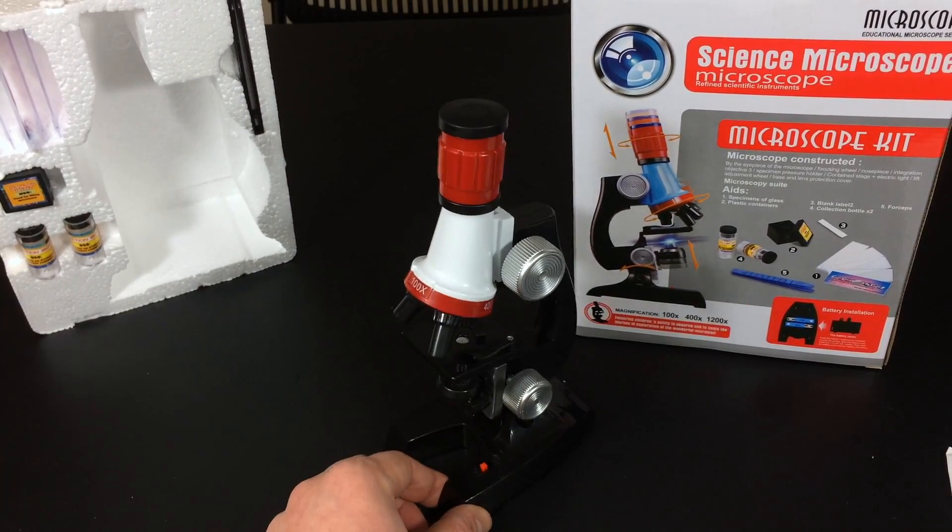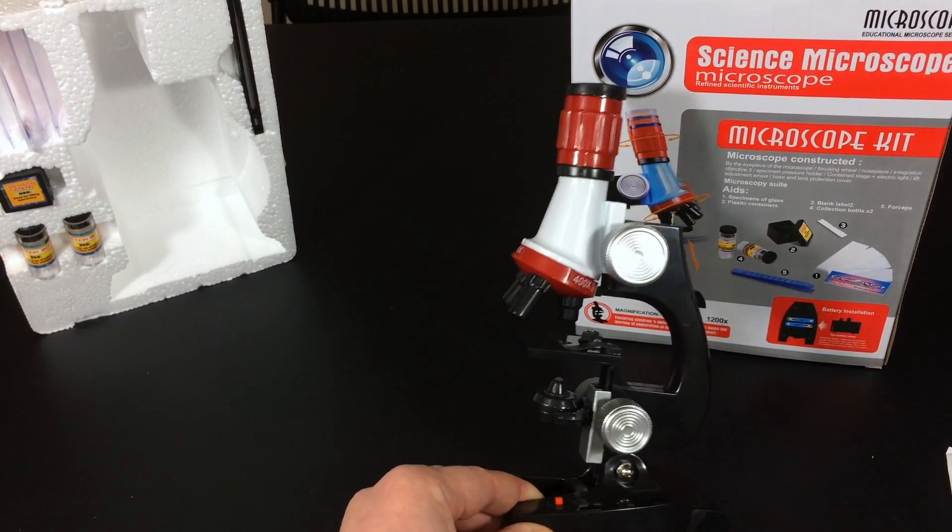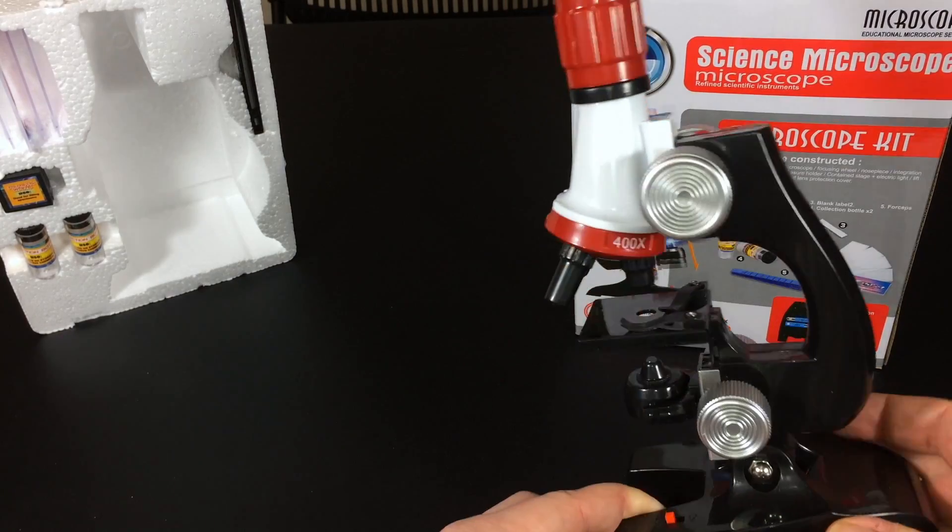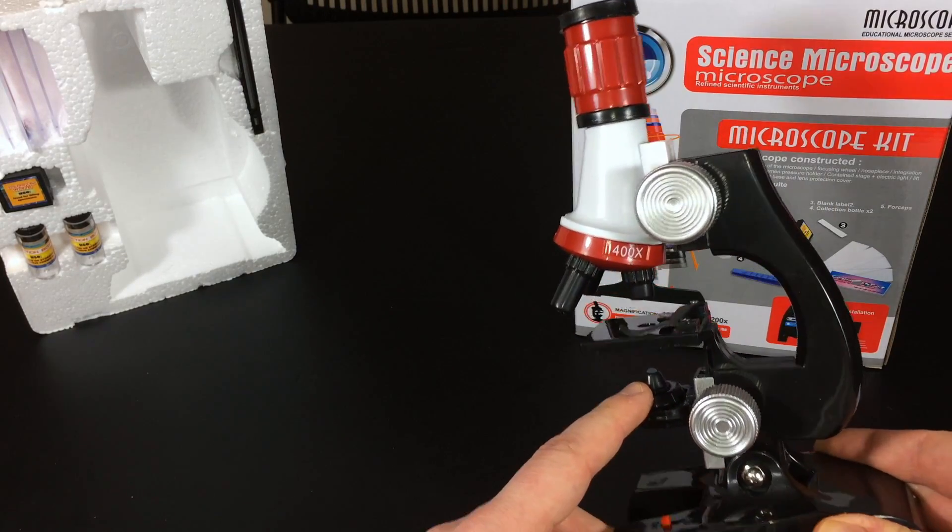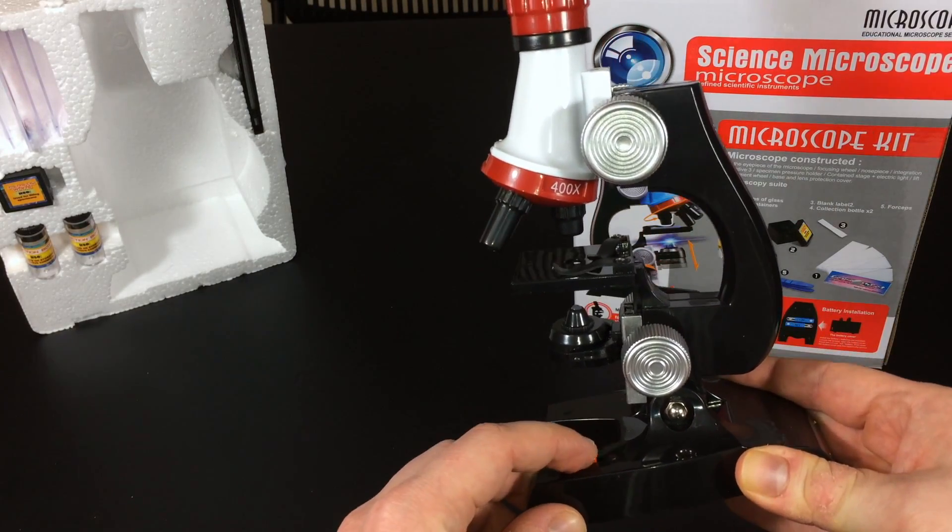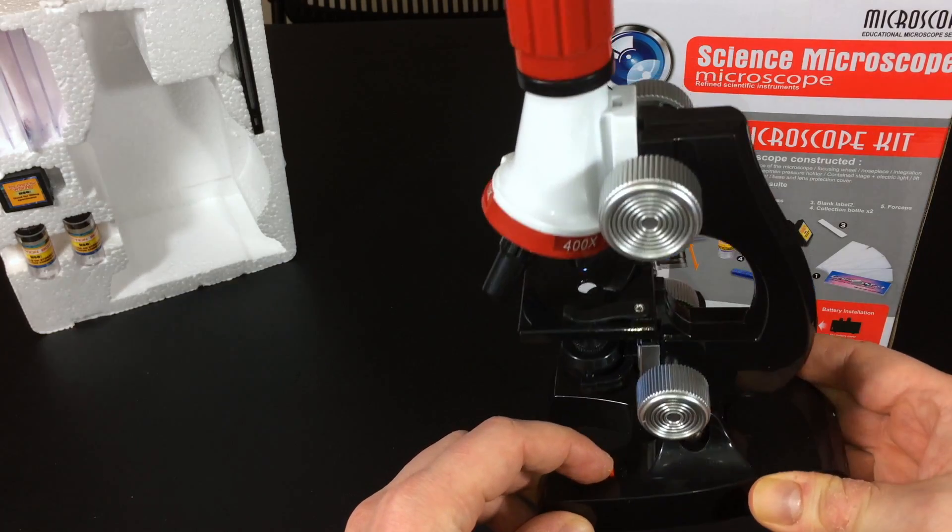Okay, so I put in a pair of AA's in here and now this light right here should be able to light up. So we're just going to check it out. There's a little LED right here on the base. And here we go. So there we go. We have some pretty good light.